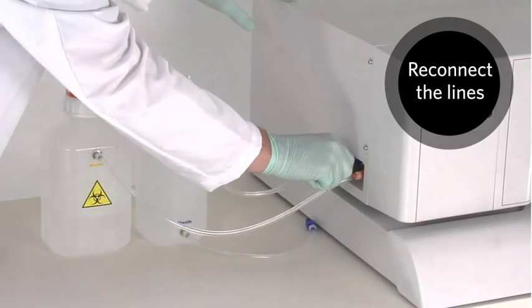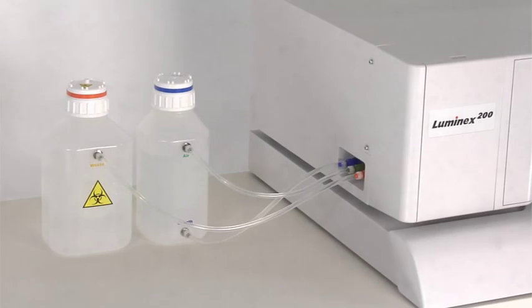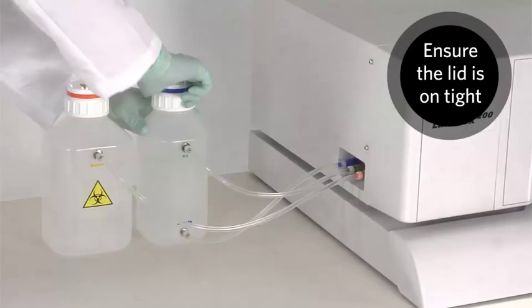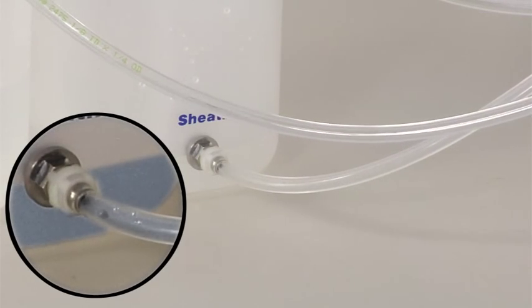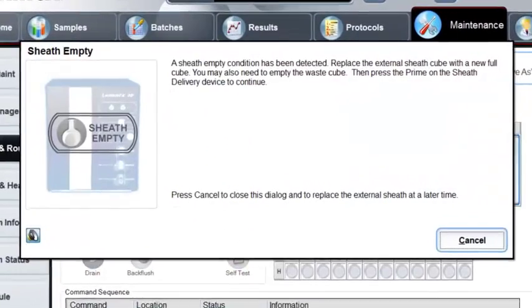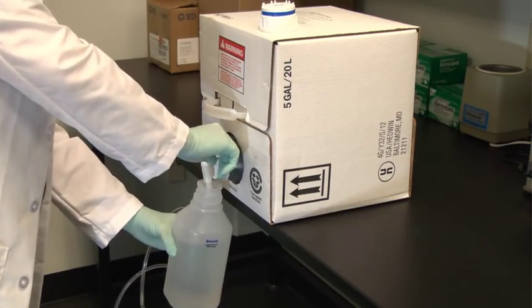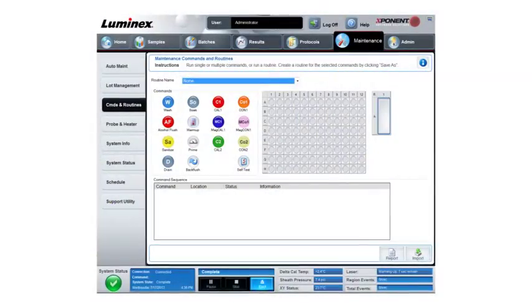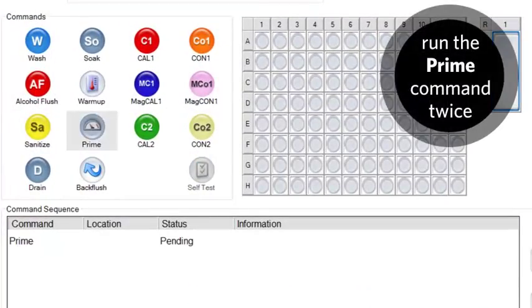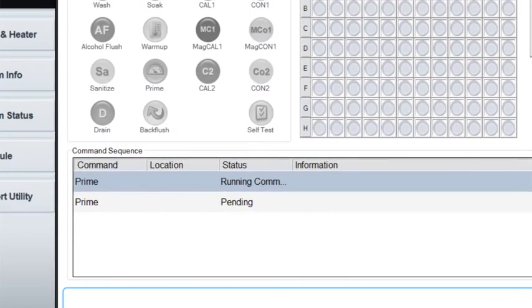Reconnect the sheath and air lines. Make sure the lid is tight enough to maintain pressure inside the bottle. Should the sheath fluid ever run dry from a bottle, as indicated in the software, refill the sheath fluid bottle and reconnect it to the instrument. In the software, run the prime command at least twice or until all of the air is out of the system.